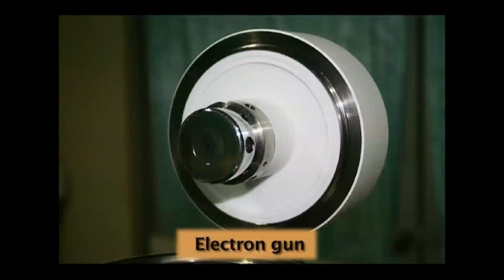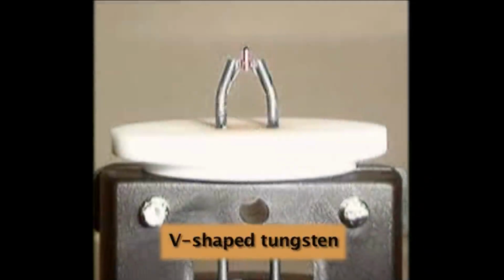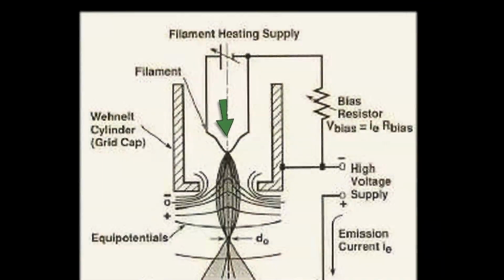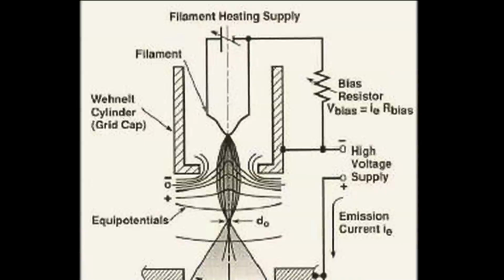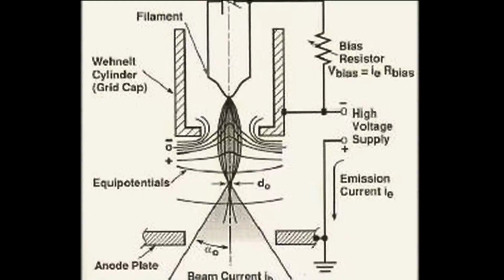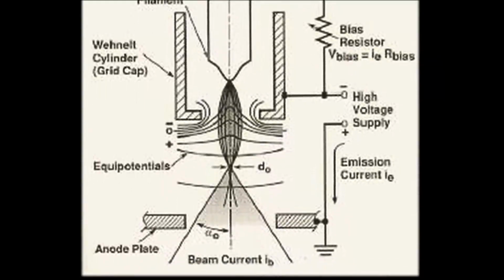Let's come to the different parts of the electron microscope. Now I am talking of the major parts. The first and the most important thing is the electron gun. The electron gun has a V-shaped tungsten filament which is present in the cone of the cathode. Now, opposite to the cathode there's an anode, and you provide an electric current. Now, as an accelerating voltage is provided to that electron gun, electrons coming out from the tungsten pass through a small hole at the end of the cathode and move towards the anode. This is the basic principle of how electrons come out of that gun.